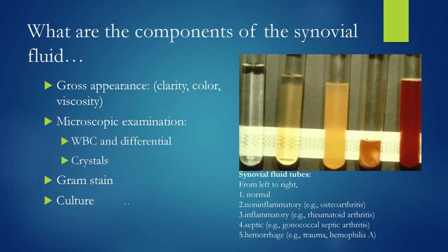Easy. He can give you any fluid sample. So you will take how many tubes? Only one tube. The tube is enough for everything: enough for gross appearance, you will see by your eyes, and enough for microscopic examination.